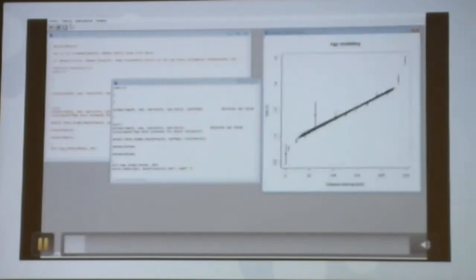So it's actually running. Yeah, okay. So it starts running, and this is the age model, starts working with the age model. The only problem that STALAGE has is that it only runs on old versions of R. It doesn't work with R with the graphical interface. It runs on version 2.1, I think. But other than that, it works really, really nicely.